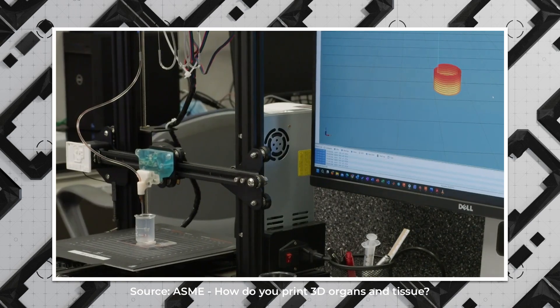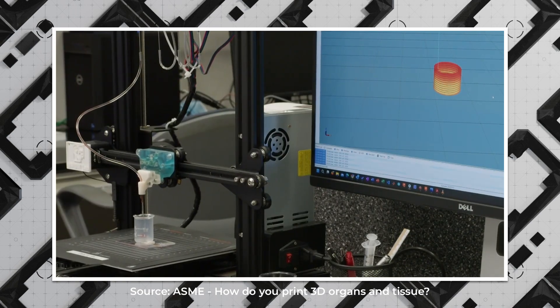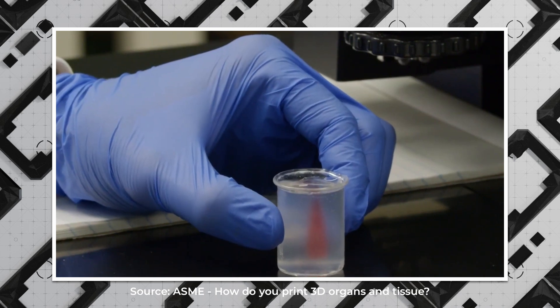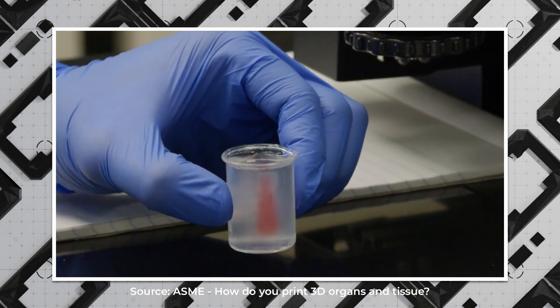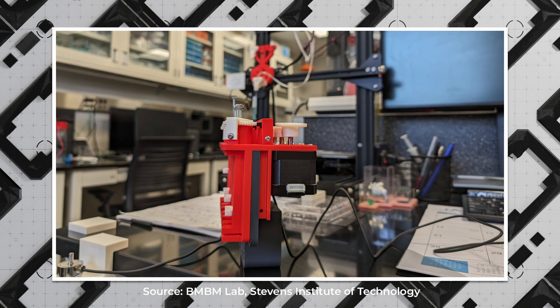We're also in the academic field, in the research academic field, so we need to publish a lot. So when we're publishing and there's something wrong, we can quickly update and modify, come up with a prototype, and then go test it. So this is very helpful. Without 3D printing, it's practically impossible to do that.